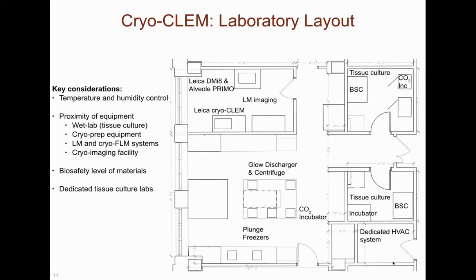While we build out a repertoire of equipment to support light microscopy, cryo-EM, and cryo-CLEM studies in our own labs and in shared research facilities, a critical component for overall success is the laboratory design and layout. At UW-Madison, we spent considerable time designing and building dedicated cryo-EM research laboratories.